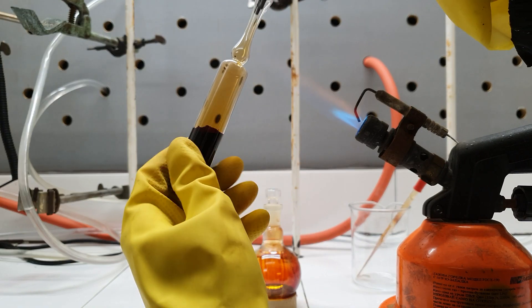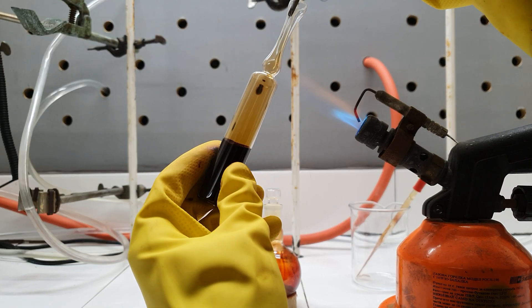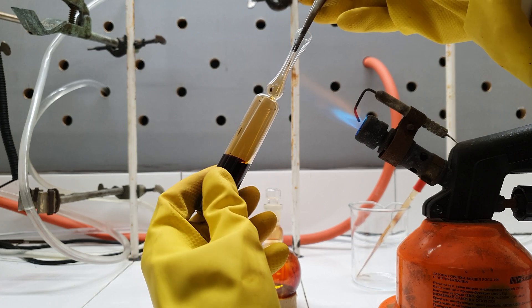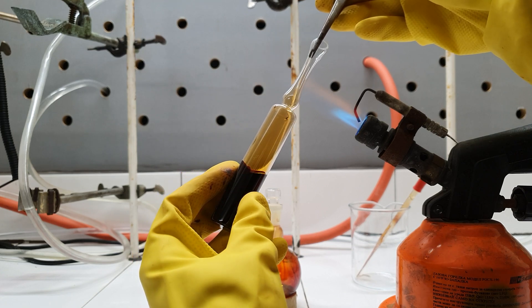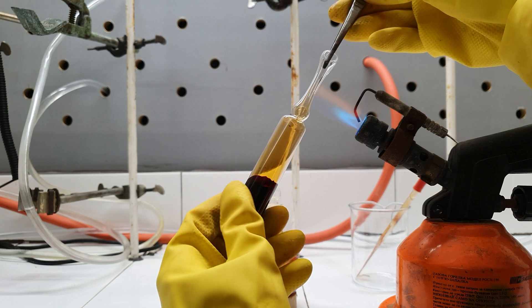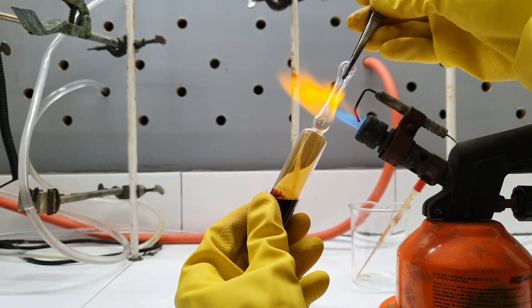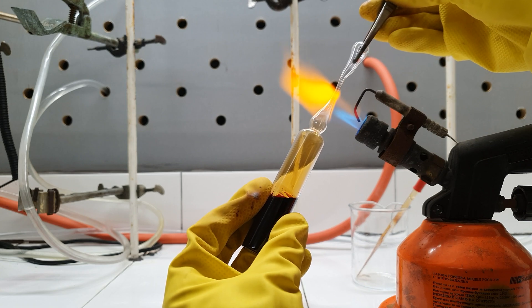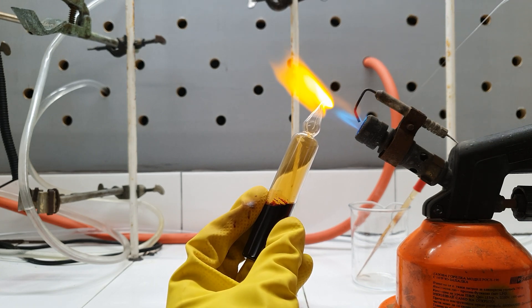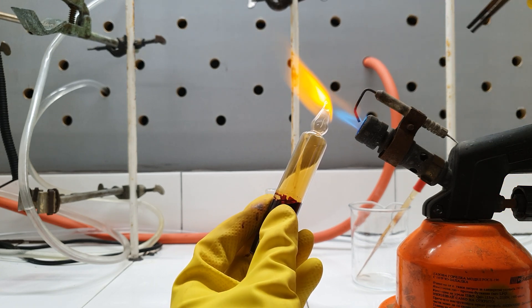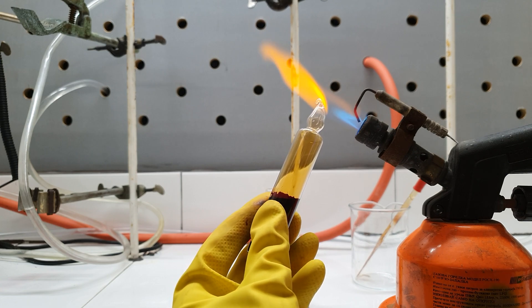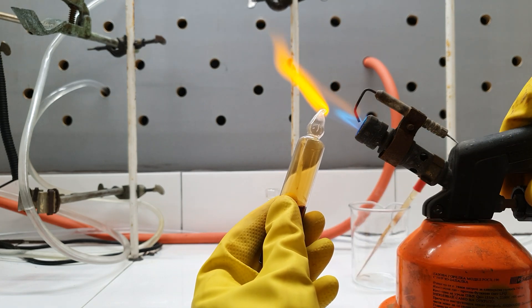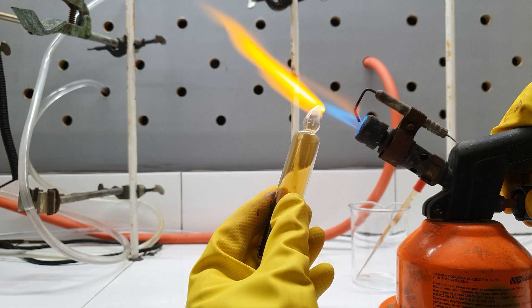To seal the ampule, I put it in the flame of my torch. It's important to constantly rotate the glass to ensure even heat distribution. When I felt the glass was soft enough, I pulled the top part with my pliers. The final step was making a well sealed top without sharp edges. This was done by placing the top part of the ampule in the flame.